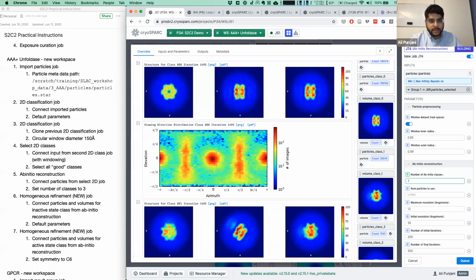If ab initio reconstruction is able to resolve a conformational change or multiple states that you believe are real, it's always worth taking the outputs of an ab initio reconstruction and putting them directly into a heterogeneous refinement. Ab initio reconstruction is working at a coarse resolution, and it's doing this special type of algorithm to search. But that doesn't mean it's very good at refining structures or at detecting subtle conformational changes, or it may also have some inaccuracy or just random noise in the classification of particles.